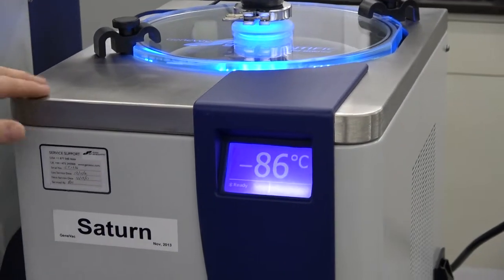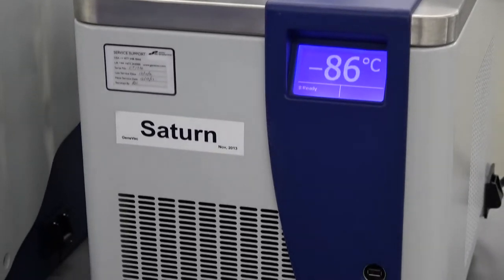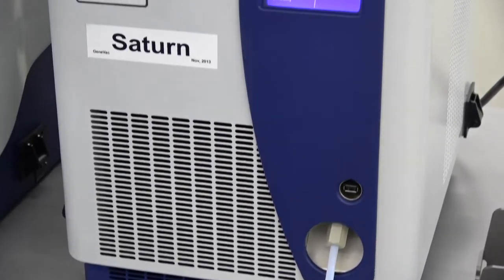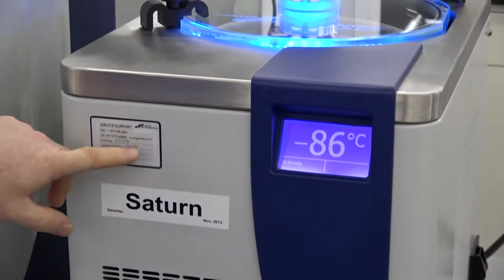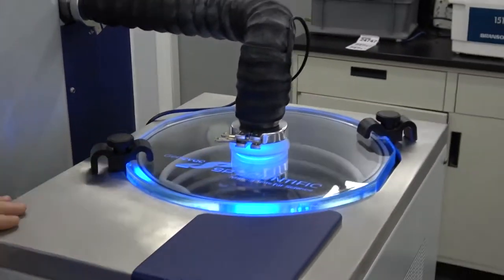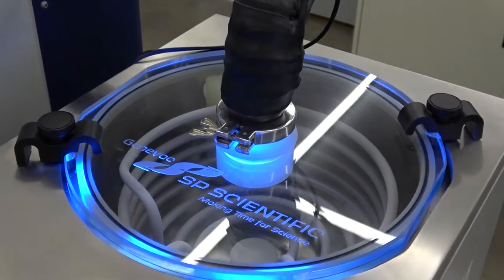And normally you would see some spots and spillage and different things if it had a lot of use, but I have not seen much at all. It's been regularly serviced by SP Scientific. You can see it's branded with our logo on the lid there.